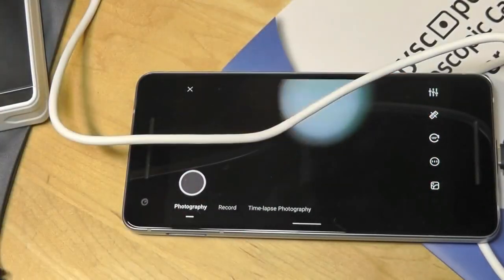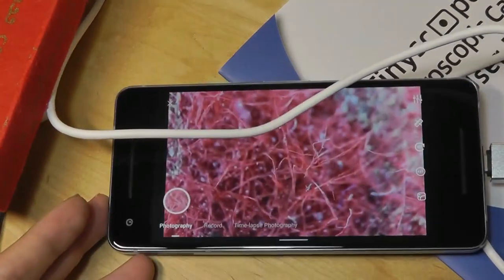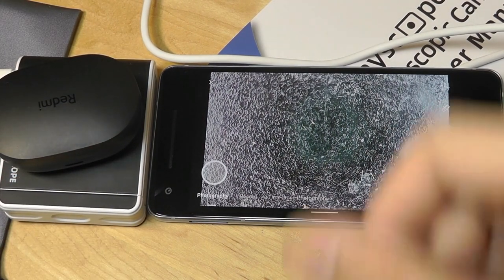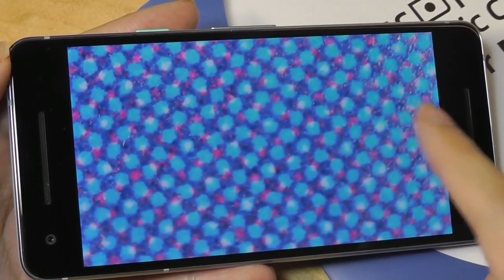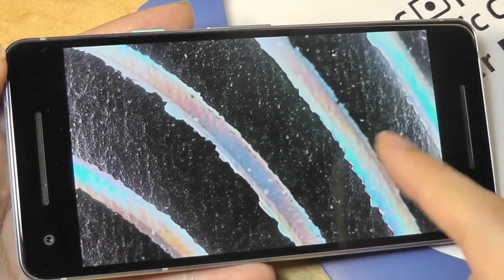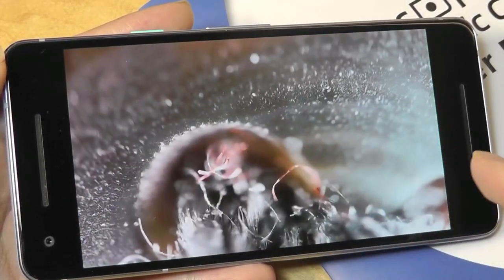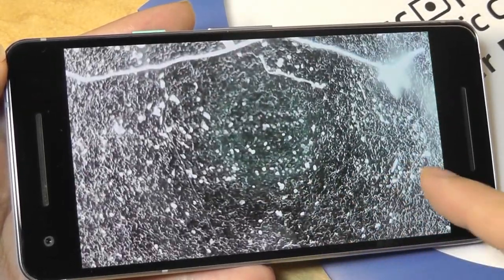Here's a box made out of fabric material — if you put it underneath, you can see the textures of the paper and fabric, which is quite crazy. You can even try plastics, and magnifying up you can see the texture of how it was printed in different layers, which is really astonishing. Here's a closer look at some other sample objects I collected over the past few days of using the camera — it really is astonishing what you can explore and find. Everyday objects blown up, and the fabrics and textures of the world around you look absolutely foreign. Some even make for a good wallpaper if you want to add a creative touch.